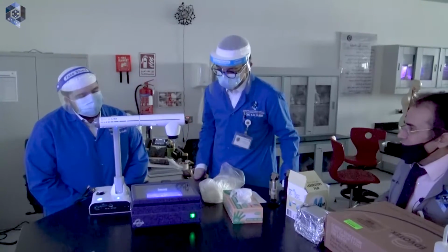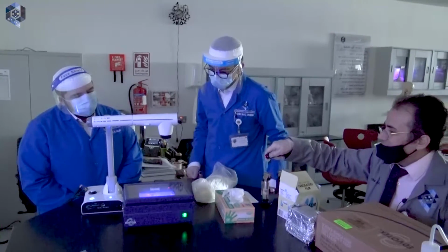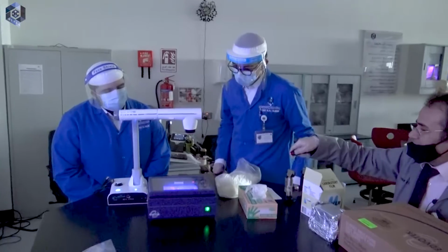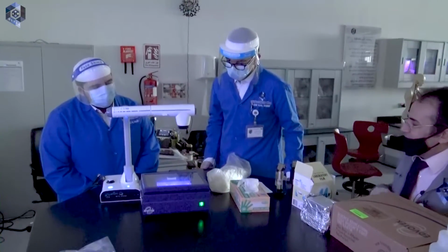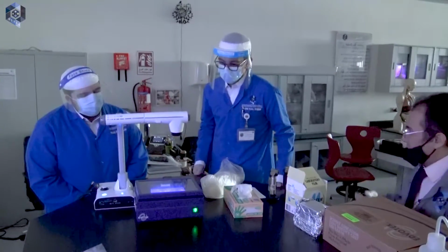Now, Muhammad, what do these bands represent? It is DNA. It is all DNA. Now, recombinant or separated? Recombinant DNA plasmid. They were ligated together. Now, why does the recombinant plasmid migrate less distance? Because it is heavier. Okay, thank you.